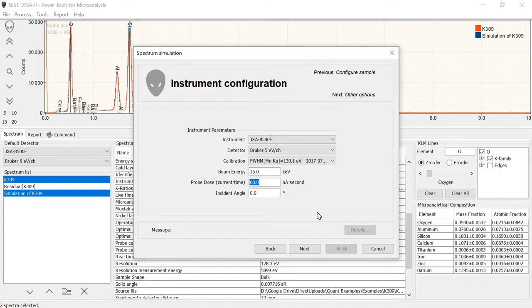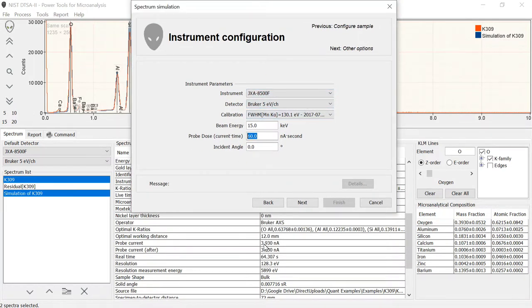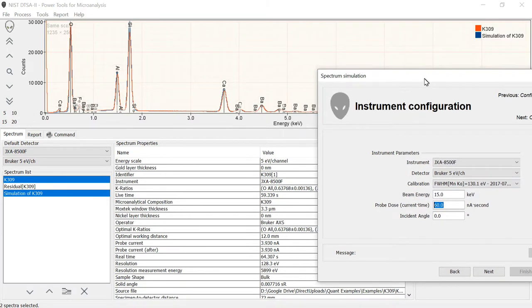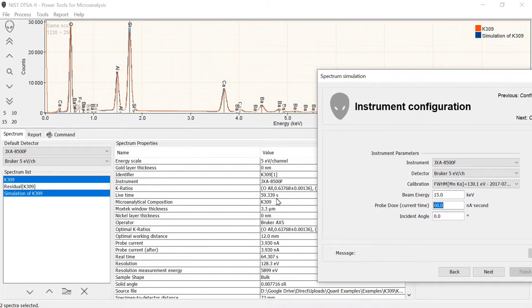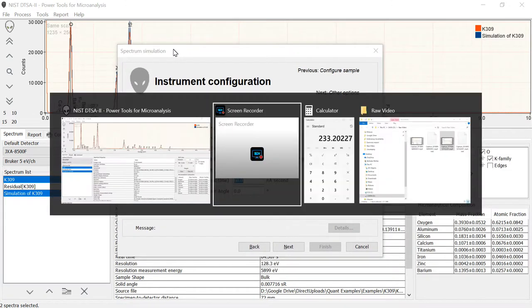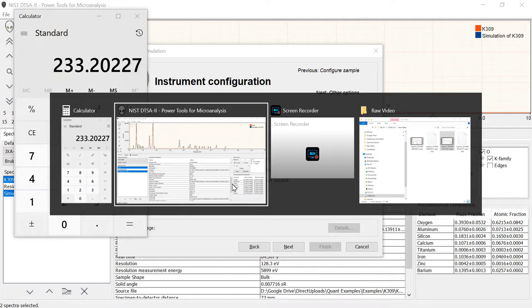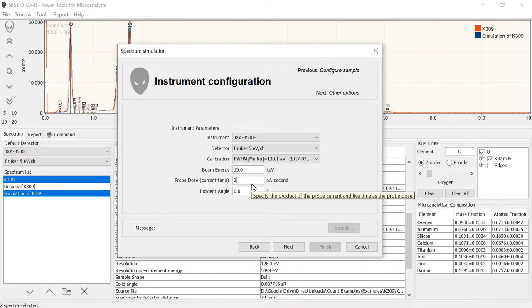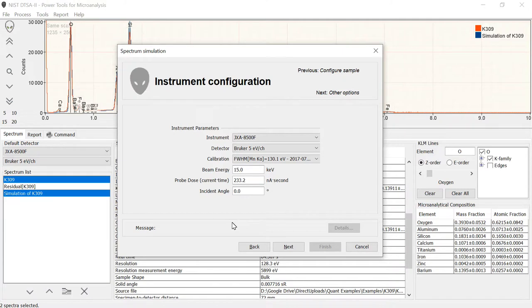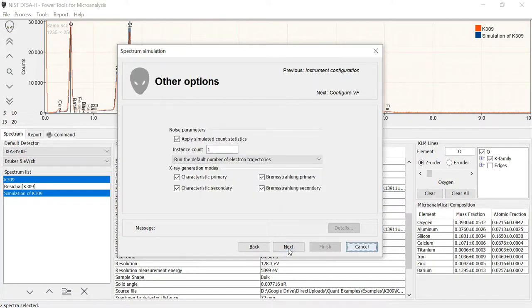Probe dose, this is the probe current times the live time and is entered in nanoamp seconds. If we go down here, we can see that the probe current was 3.93 and the live time is 59.339 seconds. If I use my handy calculator to get the product of that, I find it's 233.2 nanoamp seconds. So I'm going to enter that, 233.2 nanoamp seconds. And we also get to select an incident angle. The incident angle is the tilt of the sample and so usually this is going to be zero, but you can enter in a number if you want to. Next.